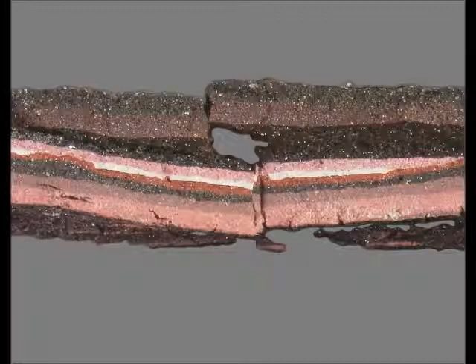FTIR microspectrometry can be very helpful in supporting mechanical fit matches of paint chips. A physical match can be enhanced by comparing the chemical components of the layers in matching paint chips like the one shown here. FTIR showing similar absorption bands in each layer would increase the likelihood that these paint chips are from the same source. Micro FTIR can be very powerful in paint analysis.